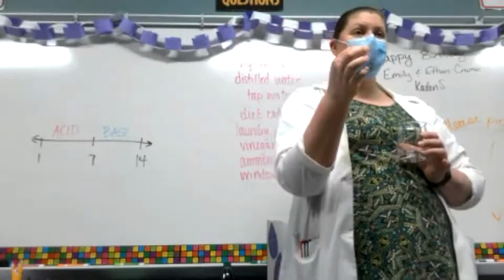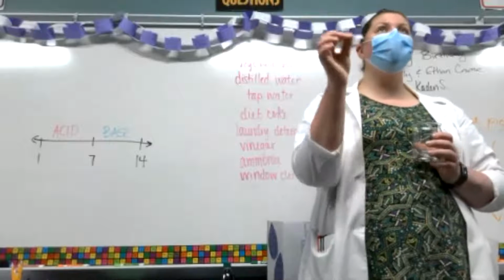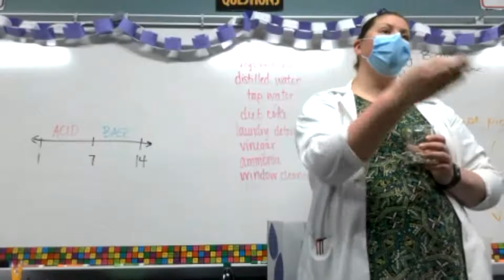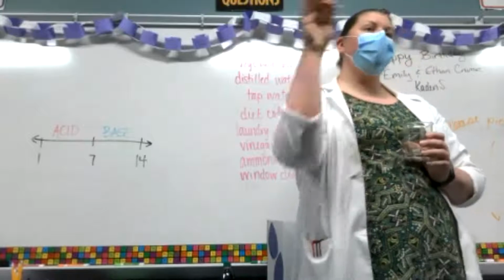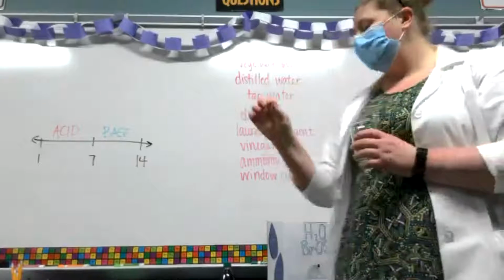Yeah. What about the neutral stuff? So neutral, it will stay blue for the blue paper. It'll stay red for the red paper. So that's why we have the pH, to try and solidify what it is, you know, kind of thing.